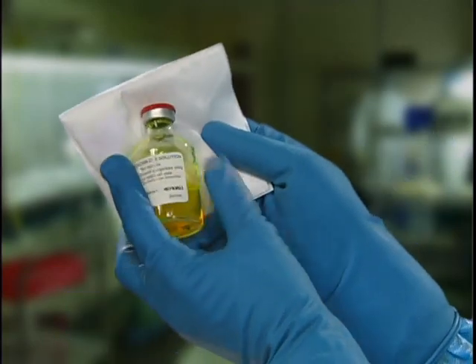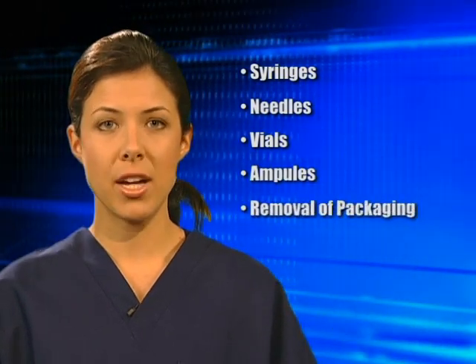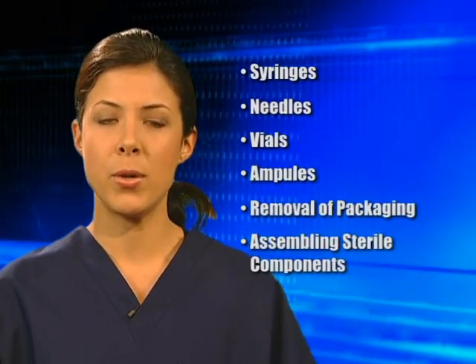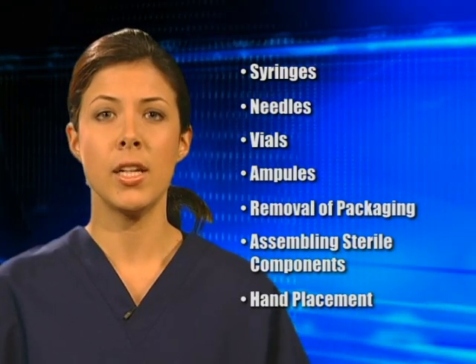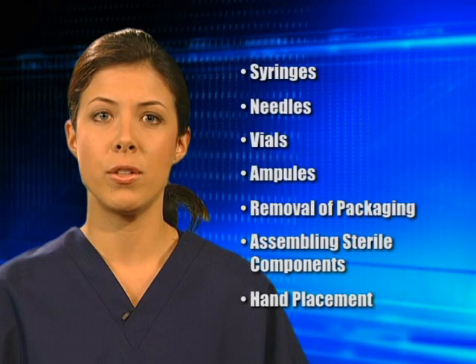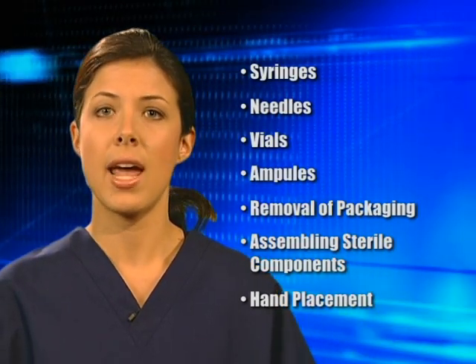As a result, aseptic technique requires specific manipulations for syringes, needles, vials, ampules, removal of packaging, assembling of sterile components, and hand placement. Basic aseptic technique should be used when handling parenteral dosage forms or medications not given by mouth, as well as irrigations and ophthalmics.